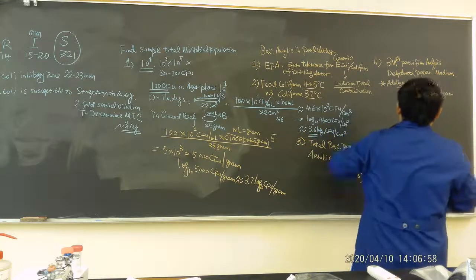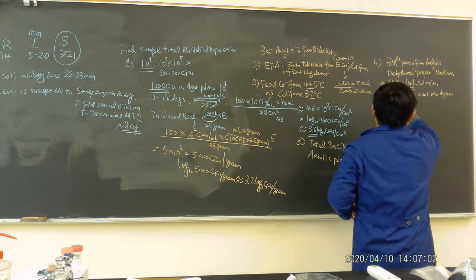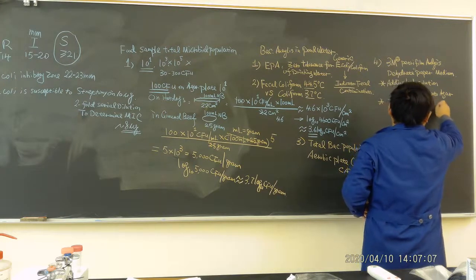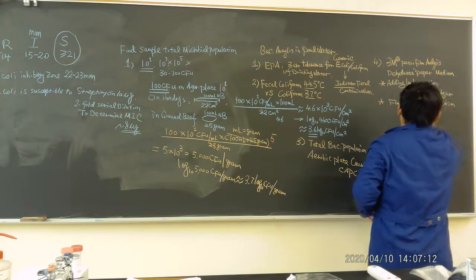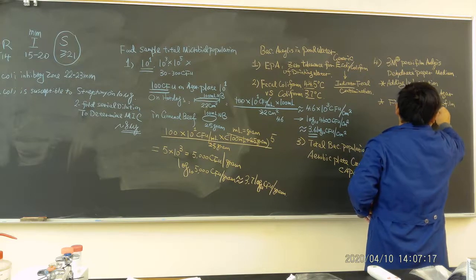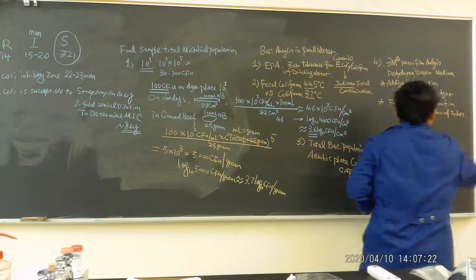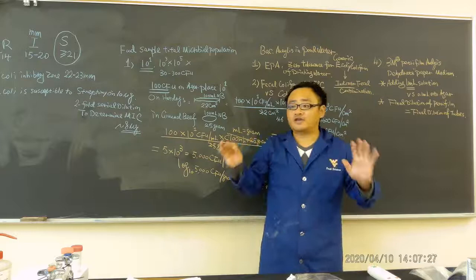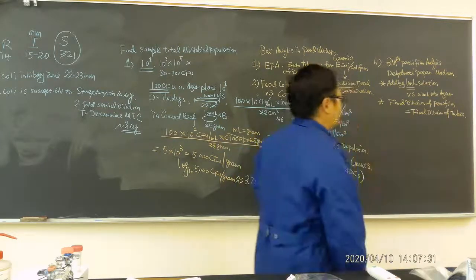Now, why is this important? This means the final dilution of Petrifilm equals the final dilution of the tubes. Remember, we did the tube, we added 0.1 ml there, and I said that will be 10 times more than the tube. But here they should be the same.